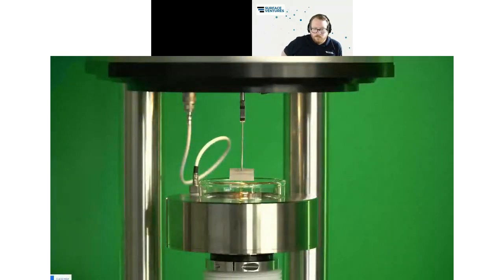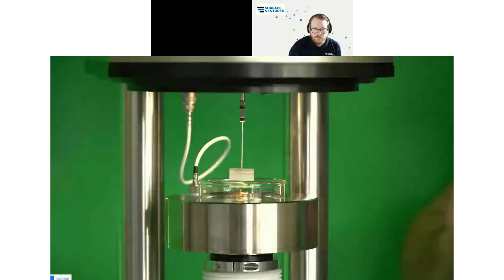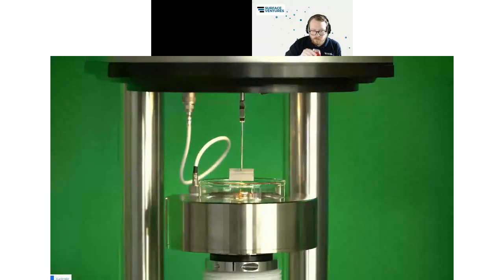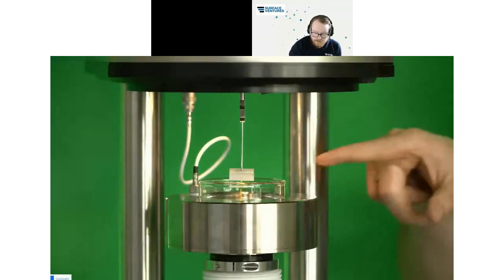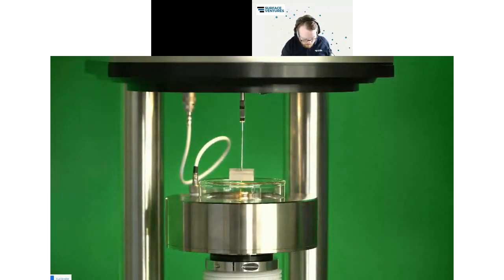What I want to show you before I start the experiment, this is here our Wilhelmy blade. And this blade is made from platinum iridium. It's a very sensitive device. What we typically do is after each measurement, we wash this blade with water and a bit of acetone, and then we heat it up with a Bunsen burner.